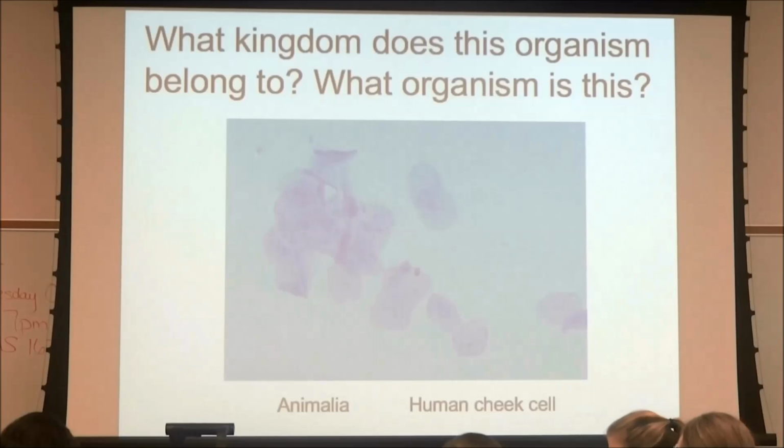You can take your pictures at any time. Because they're overlapping, the nucleus. They're kind of roundish, right? They overlap and they have that central nucleus.